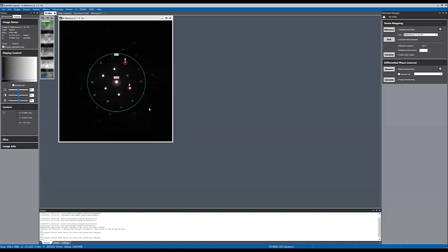If you have set up your camera length to include high signal to noise ratio reflections, higher orders, it is better to include them. But the software has a threshold in it. If it doesn't find enough signal to noise ratio in the reflections that it finds, it's going to ignore them. For now, to save time, I'm just going to make this small and move on.